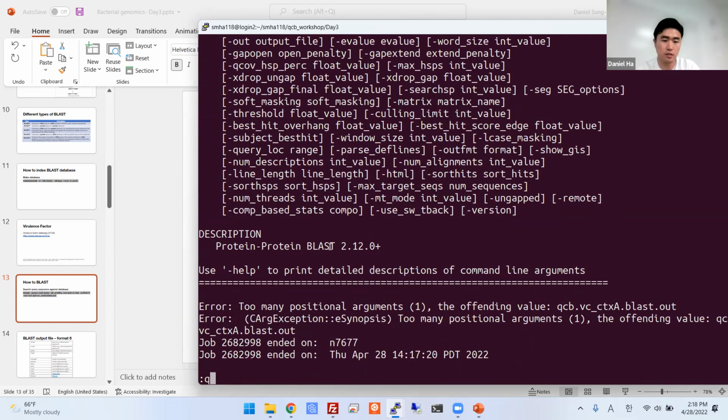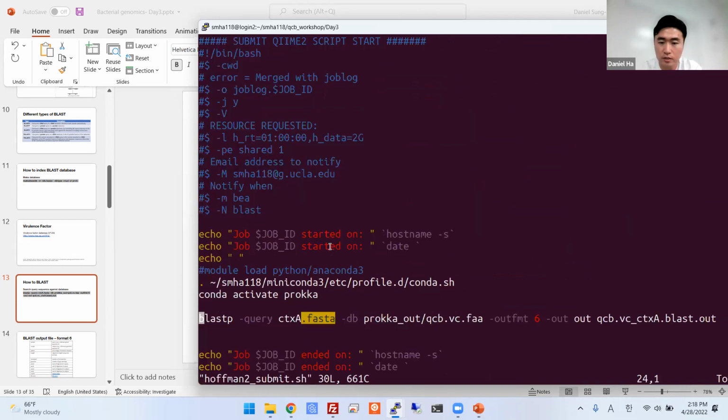Oh, sorry, I think the command has an error. There shouldn't be an extra out there, so you need to delete this and submit.